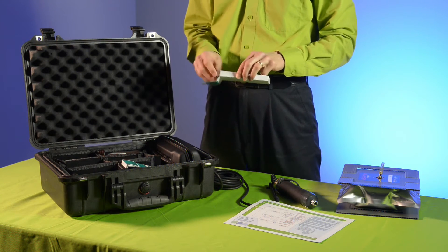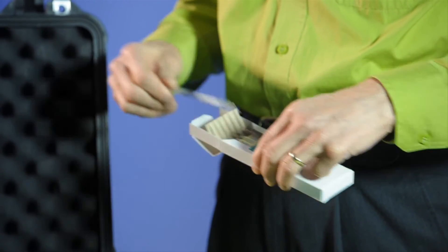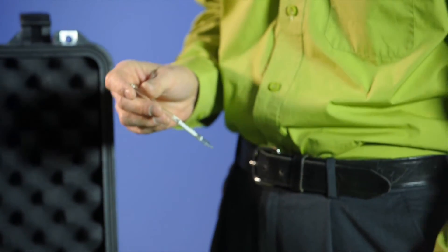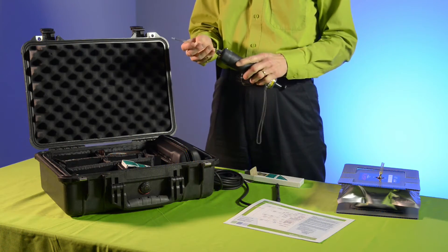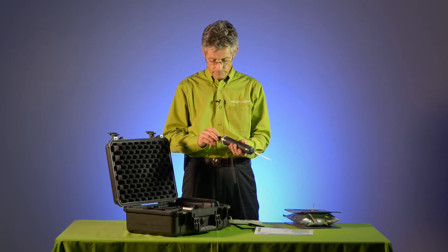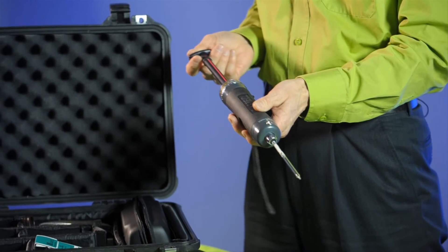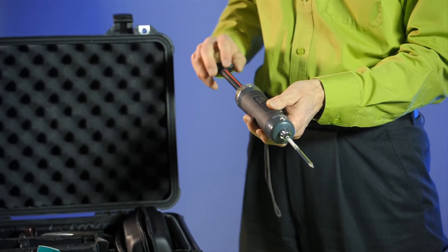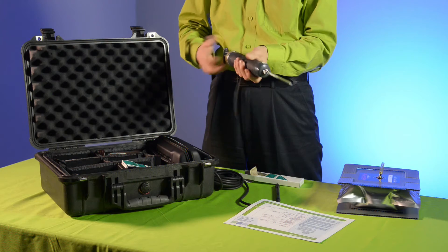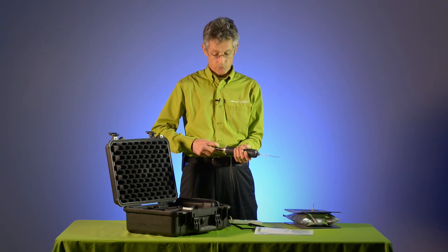Before taking any measurements with the tubes, we want to do a leak check, making sure that there are no leaks and that the pump is going to draw in exactly 100 milliliters of air through the tube. Inserting the tube without breaking the tip, we should have a perfect seal. Pulling back on the piston and letting it lock for 15 seconds, we can then release the piston and the vacuum should force it back to its starting position. If the handle only goes part way, then the pump is leaking and will need to be serviced.